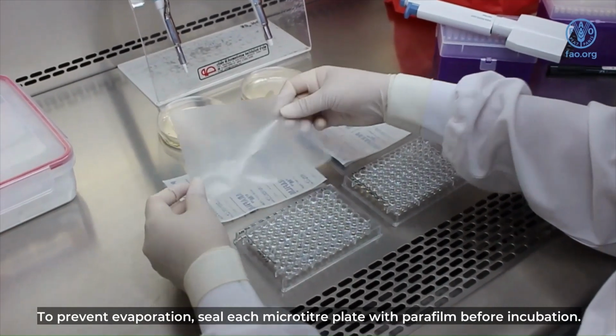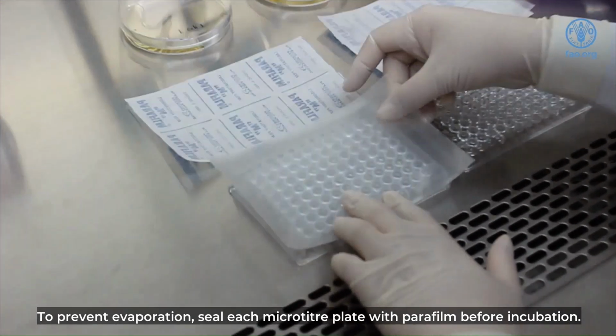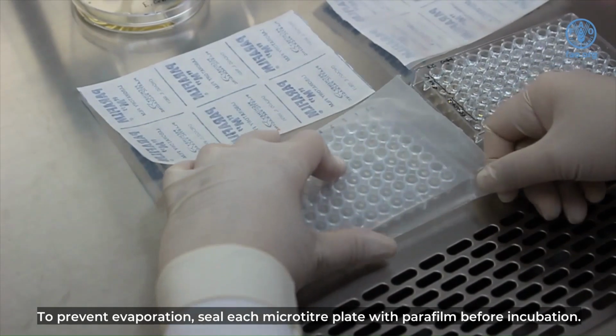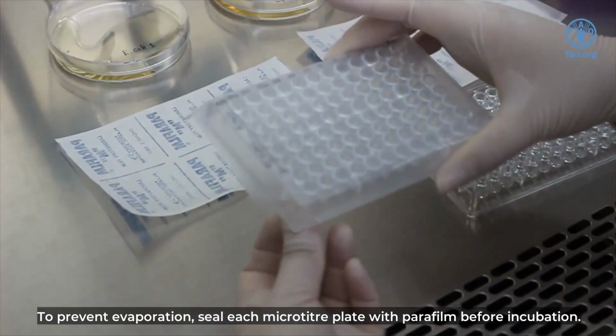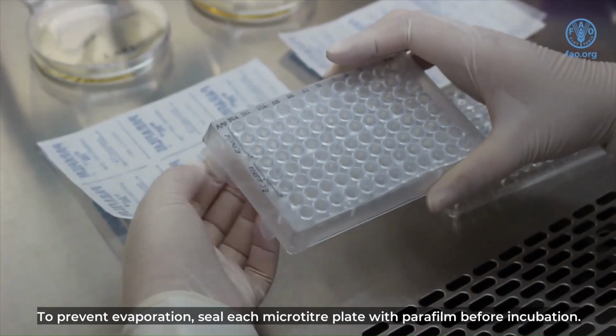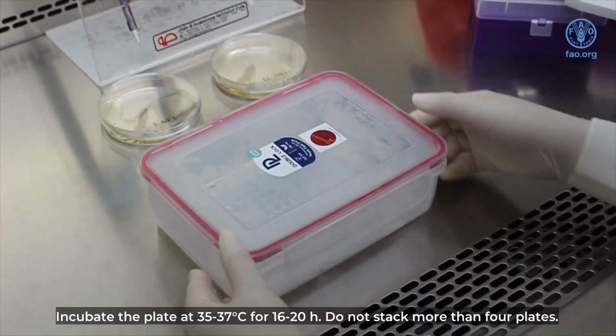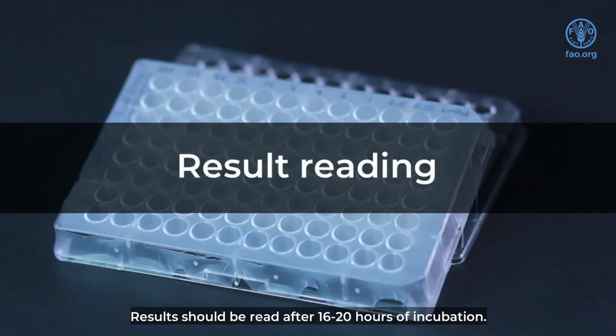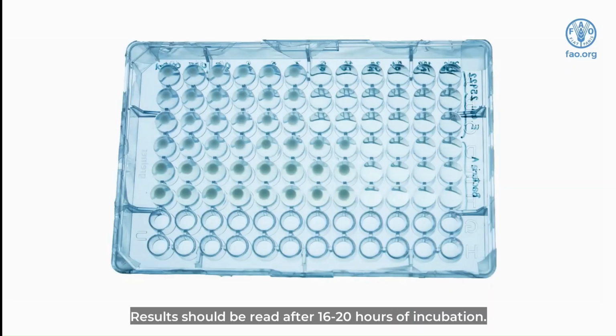To prevent evaporation, seal each microtiter plate with parafilm. Incubate the plate at 35 to 37 degrees Celsius for 16 to 20 hours. Do not stack more than 4 plates. Results should be read after 16 to 20 hours of incubation.